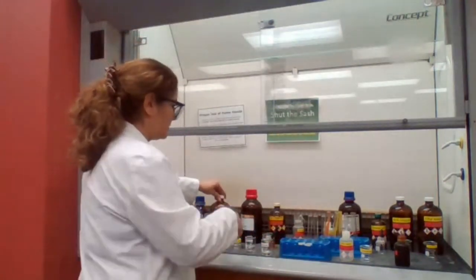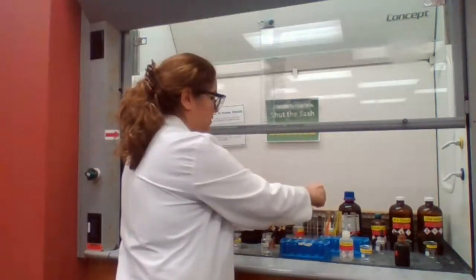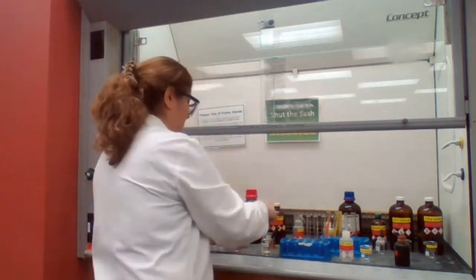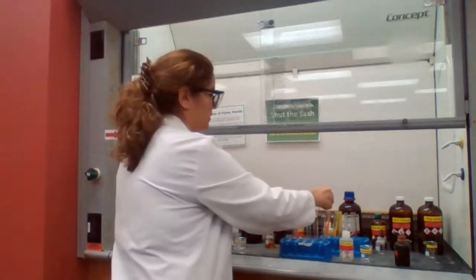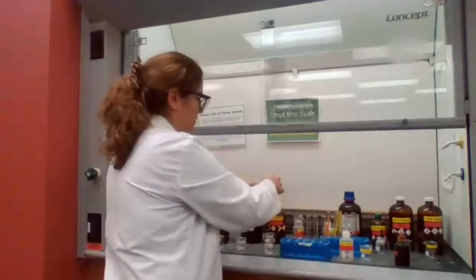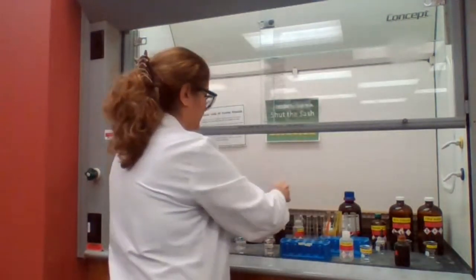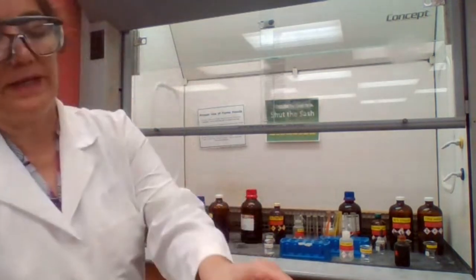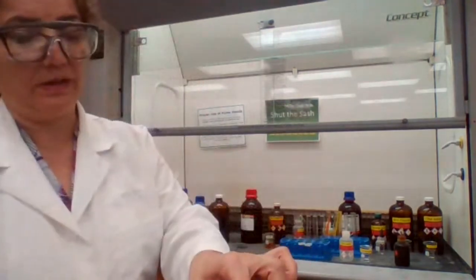Adding cyclohexanone, acetophenone, and butyraldehyde. Going to let you take a picture like this with the test tubes on top so you see the difference.